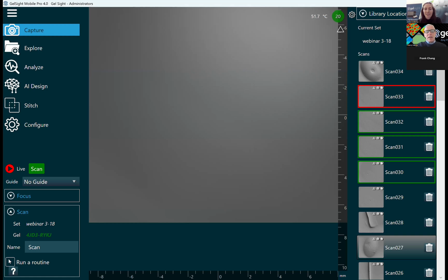All right, and then when do we anticipate having 3D stitching measurement capabilities? That's a great question. I don't have a timeline for that. But right now you can see the STL file, you can download the STL file, but our system is a single micron accuracy system. So when you're stitching these images together, the challenge is the 3D at those interfaces, right? And we want to have that very accurate system across that too.